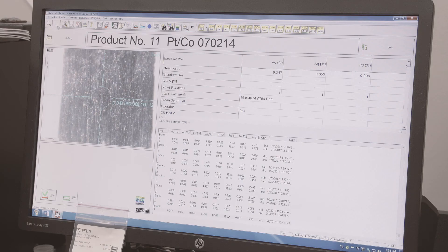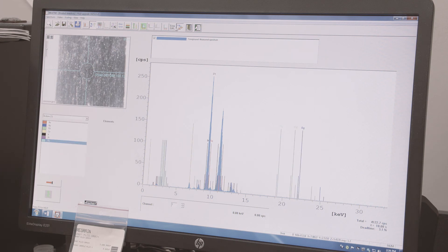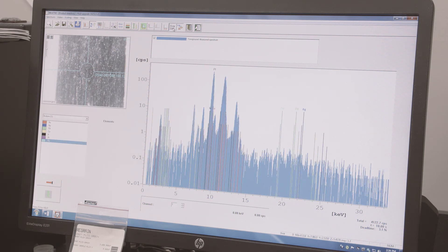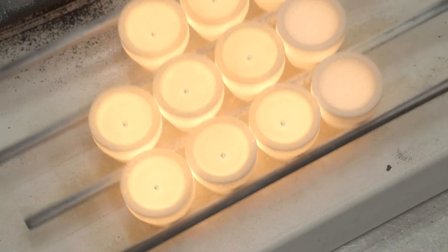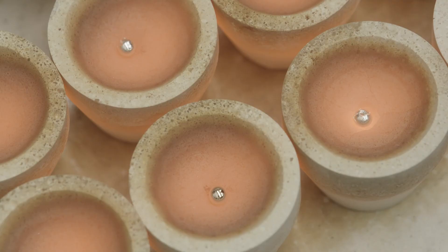In less than three minutes, the lab can determine the elements of the sample's surface. Thanks to our assay lab technicians, customers know that they are buying with confidence.